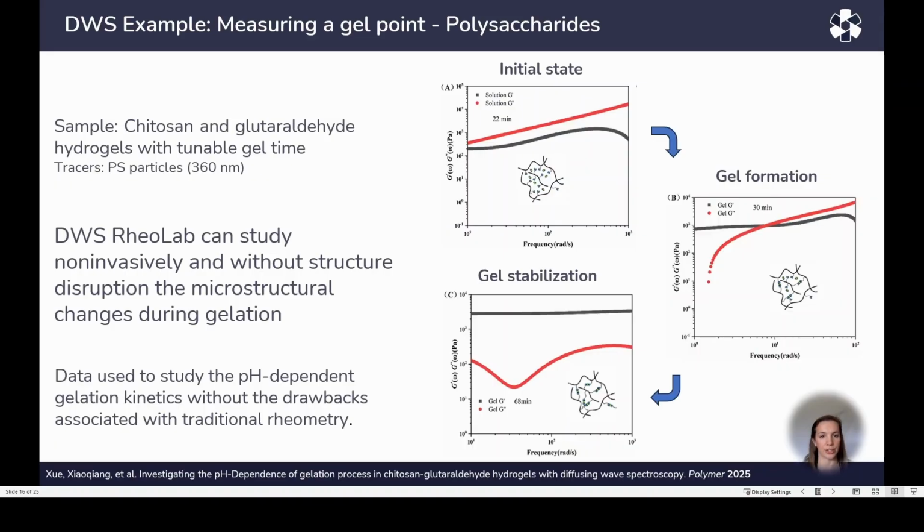point characterization. You can see here the G' and G" curves for the liquid sample before it forms a gel after 22 minutes. After the gelation, the gel continues to change during a stabilization step. This process was finished after 68 minutes.